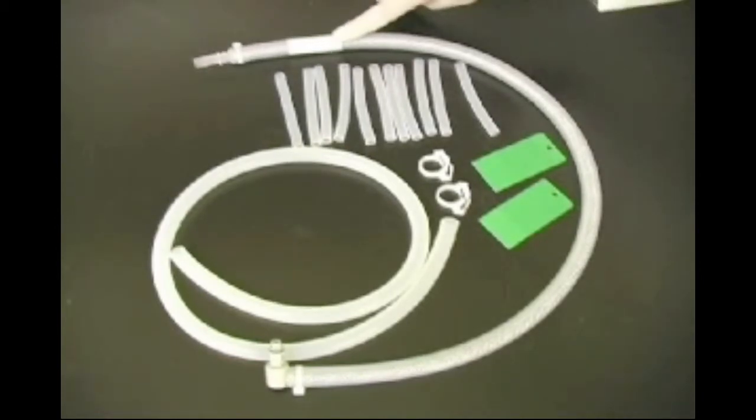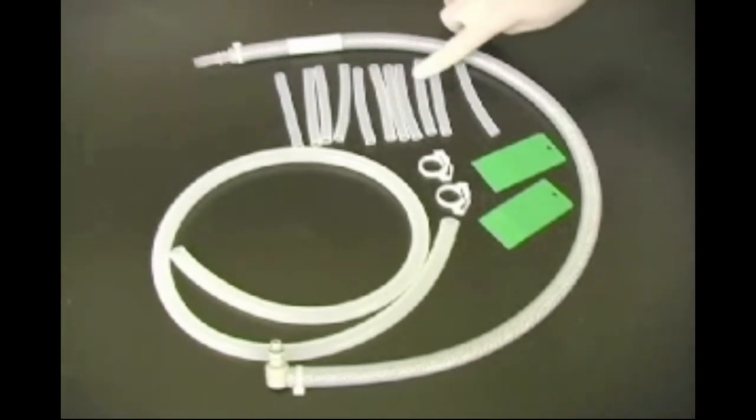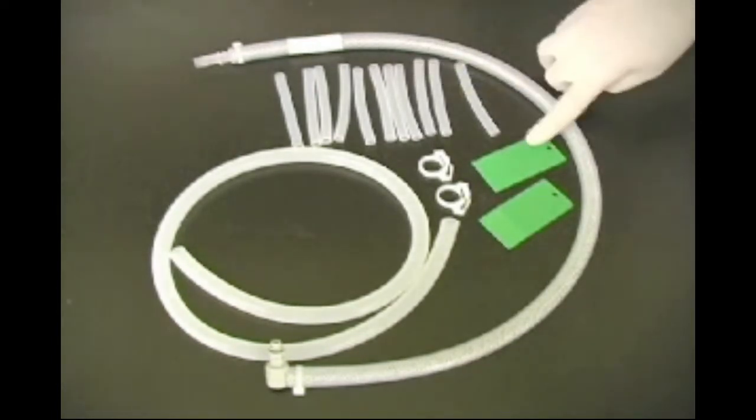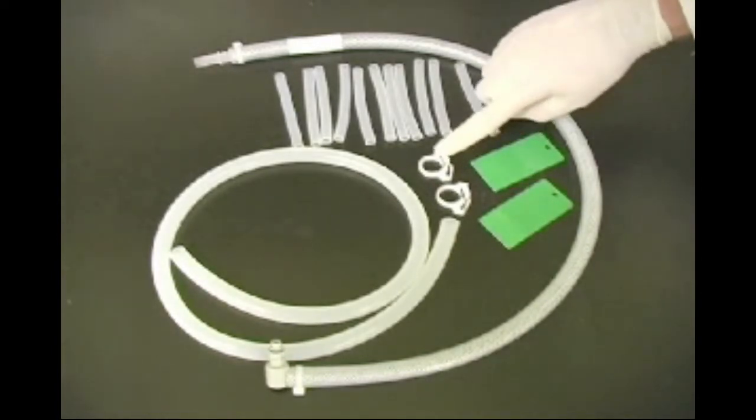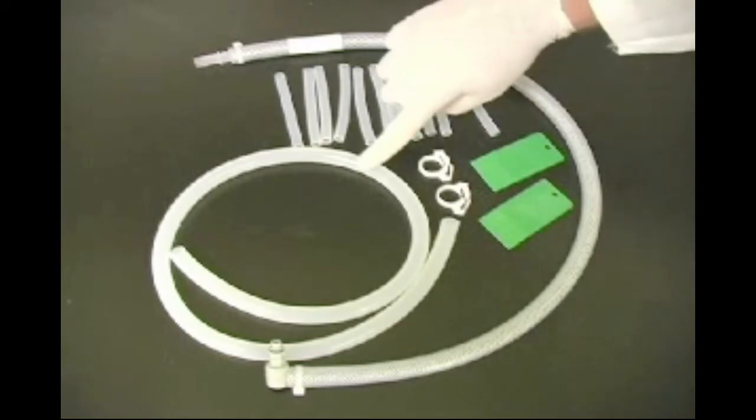Also included are the buffer exhaust tube, which connects the lid of the DodecaCell to the buffer recirculation pump, 11 pieces of manifold tubing for running shorter plates like the Protean 2 precast or handcast gels, gel releasers, hose clamps, and extension tubing that connects to the drain port.